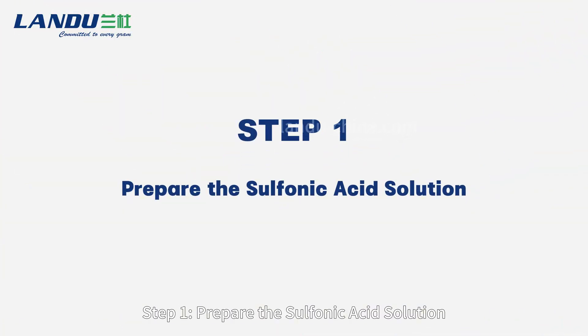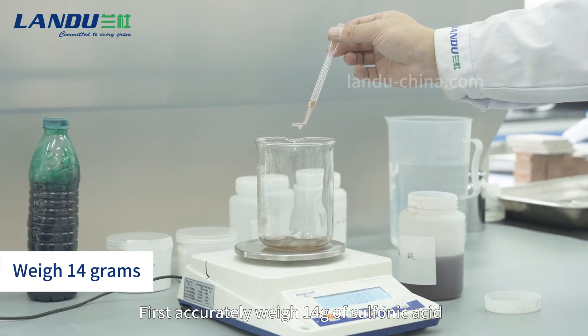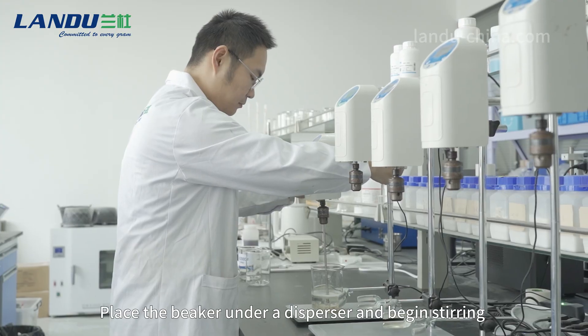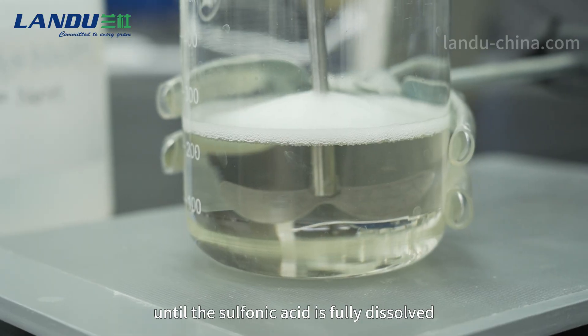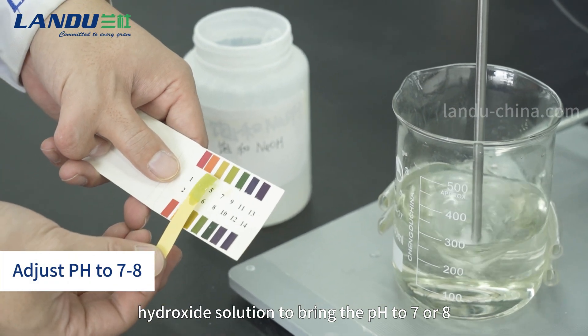Step 1: Prepare the sulfonic acid solution. First, accurately weigh 14g of sulfonic acid and pour it into a beaker. Add pure water at a ratio of 1:100. Place the beaker under a disperser and begin stirring until the sulfonic acid is fully dissolved. Adjust the pH by adding a saturated sodium hydroxide solution to bring the pH to 7 or 8.